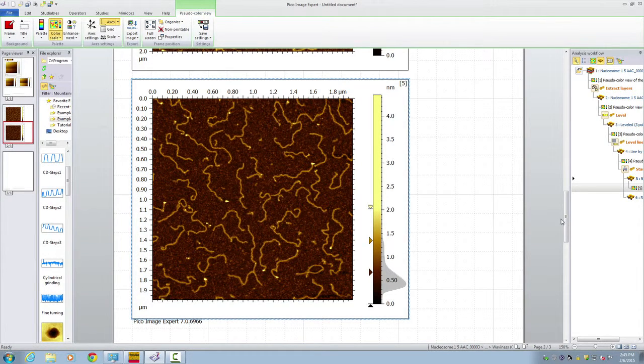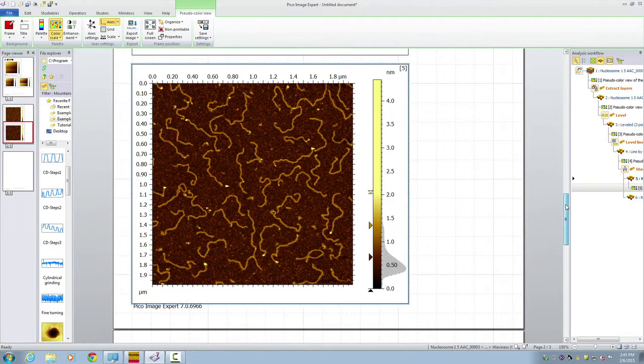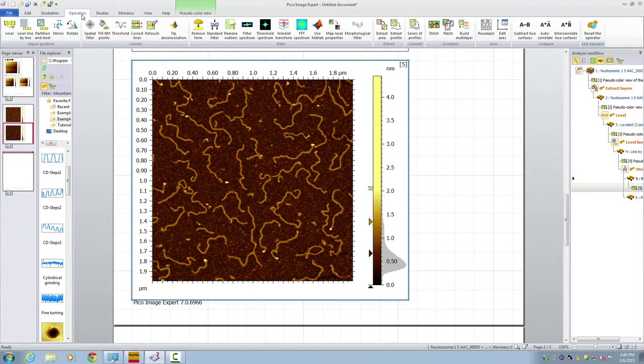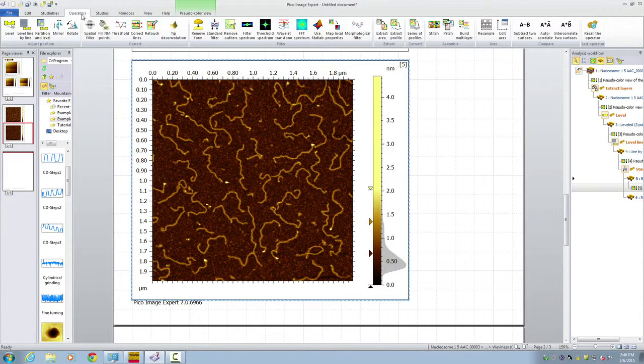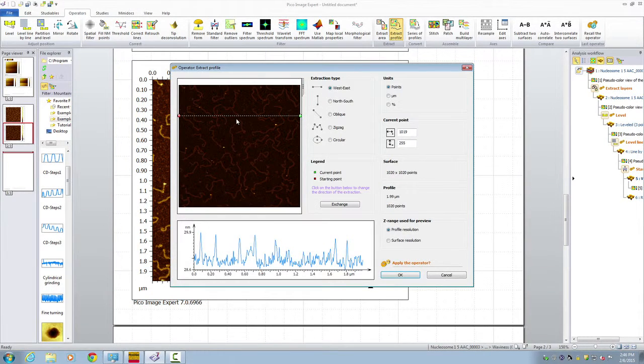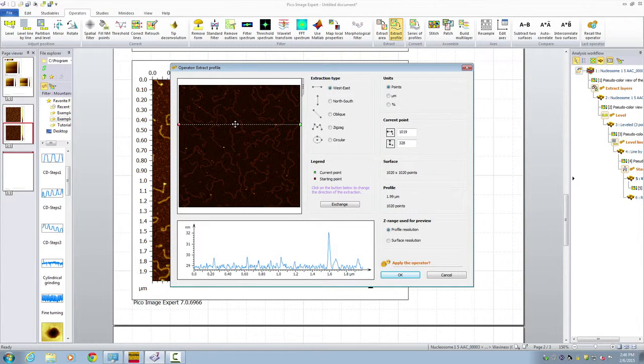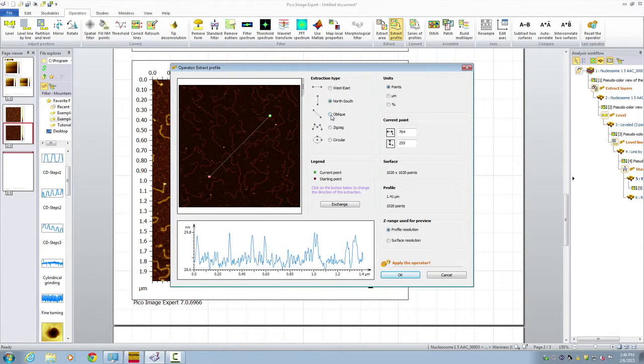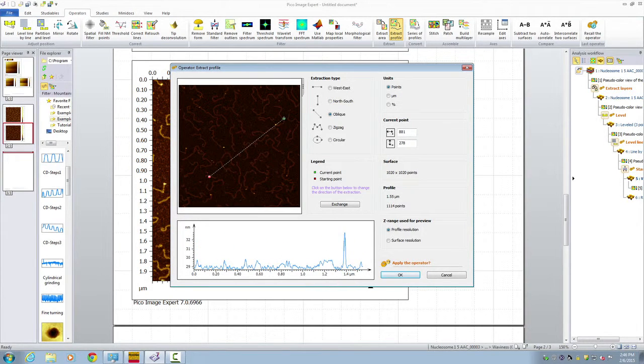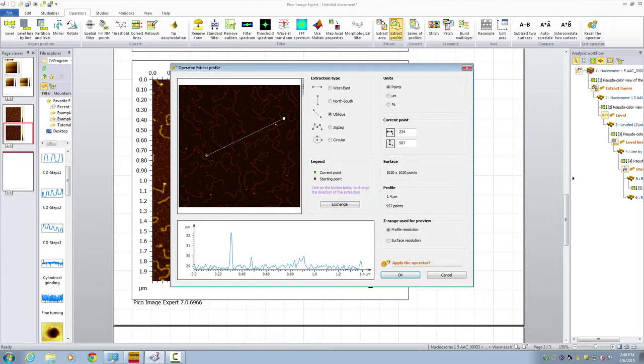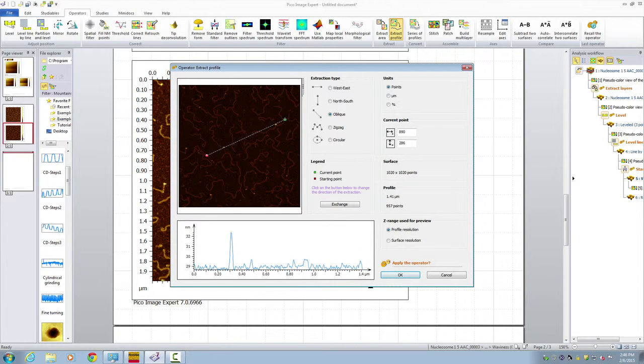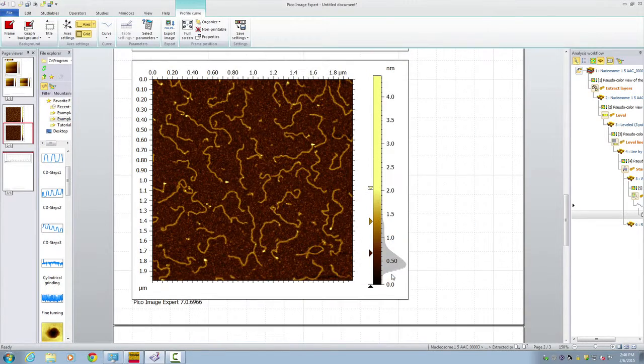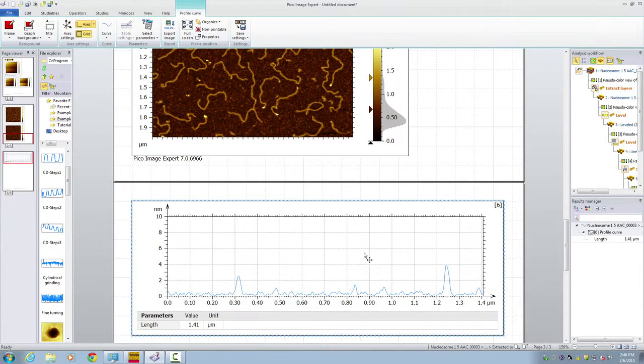Now, in order for you to do some measurement, we could also generate a profile. Again, click on the image. Go to the operators. And then, we choose Extract Profile. And here, you can choose this line, either West East, North South, or any arbitrary numbers, arbitrary points. One and two. Make sure you align across any features you're interested to measure. Click OK. And then you generate a cursor profile. And from the profile, you can easily measure the height of certain features.